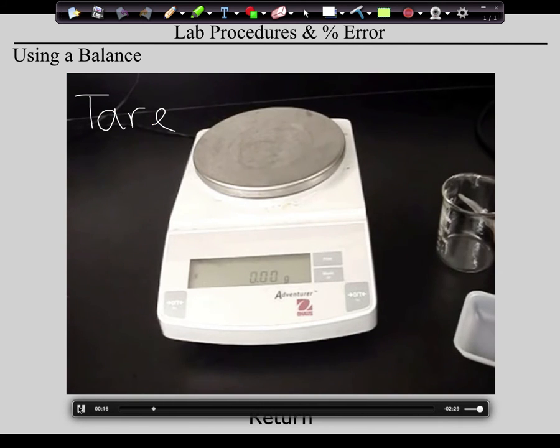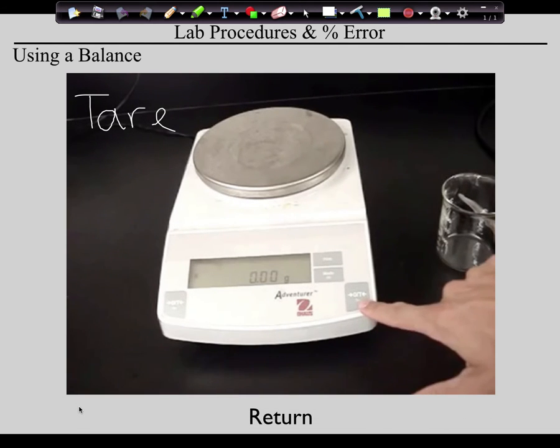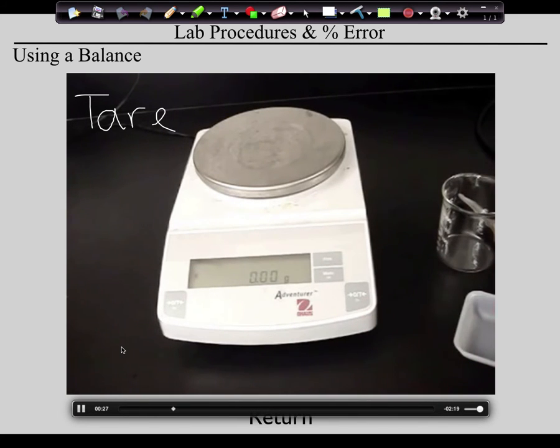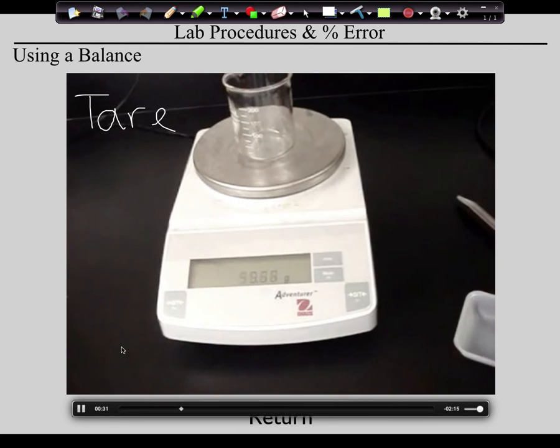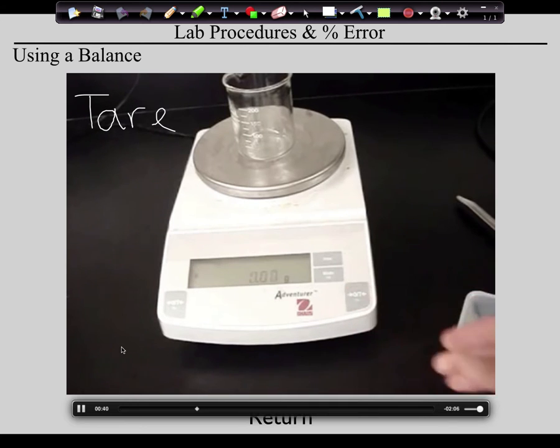Let's talk about the misuse of the tare button and the weighing dish. The tare button is located right here on these particular balances. What it does is basically subtract whatever's on the balance. Right now you can see that the balance reads zero. If I put an object on the balance, such as this beaker, we can see that the mass has changed. If I hit the tare button, that subtracts it. And now you see the mass still reads zero, even though there's something on the balance.